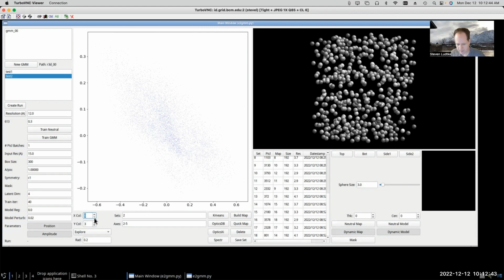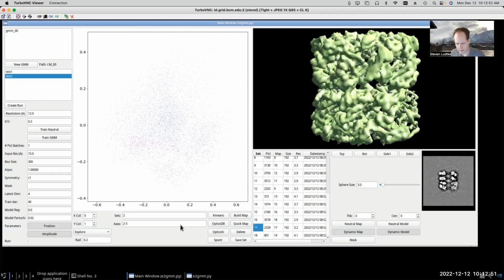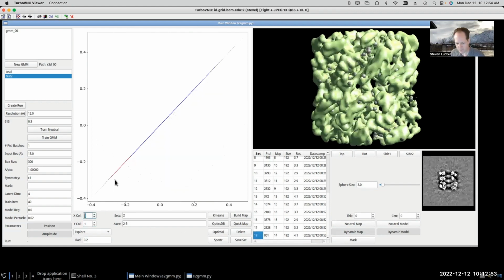So now if I wanted to make these sorts of bands that I made with these manual classes here, what I did is I plotted axis 1 versus axis 1, and then I used the make set mode to box out circles in this mode. So it's basically just using a single axis. So then all of the other dimensions are basically getting included. It's only making its classification decision based on the position on this line.